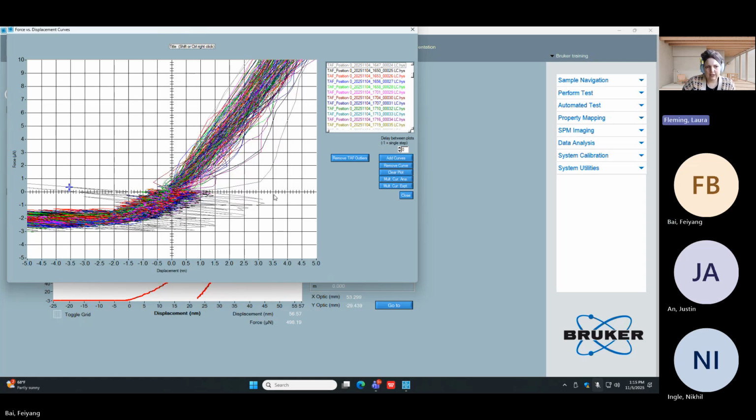Do we notice anything about, so this is the very beginning of the curves. My question to you is, do you think that's the true 0 point of the curve, where it has 0 here? If we think about it right here, oh, go ahead. I kind of think so. Seems like you start from here, plot starts. Yeah, so it actually isn't.